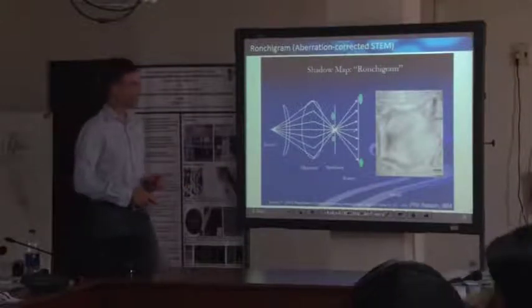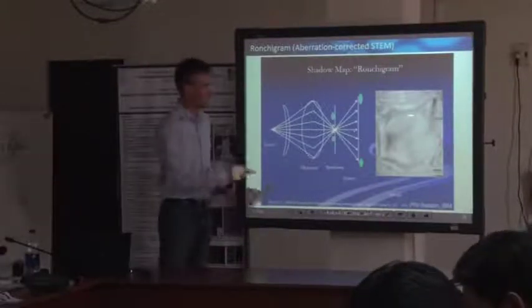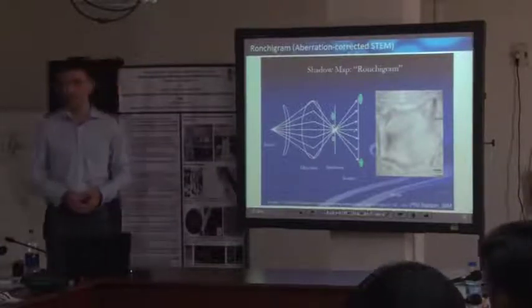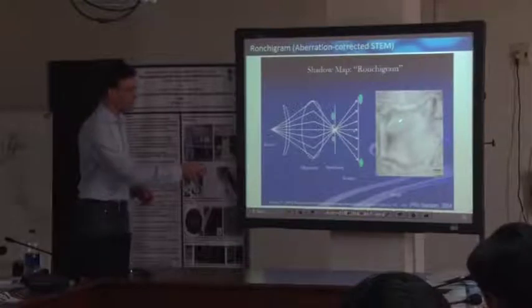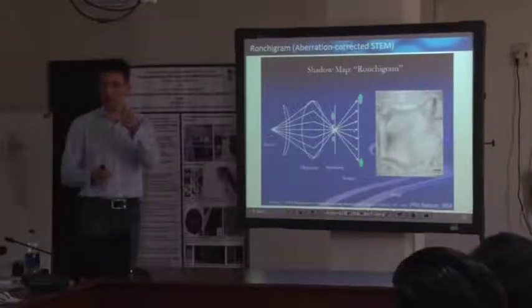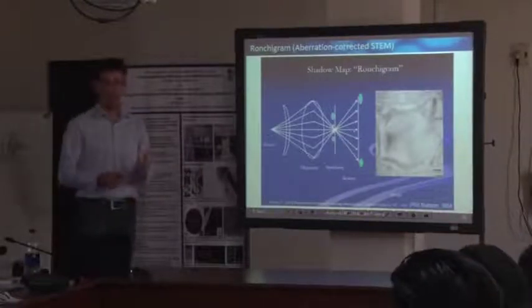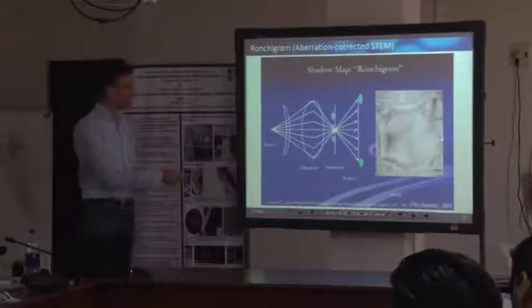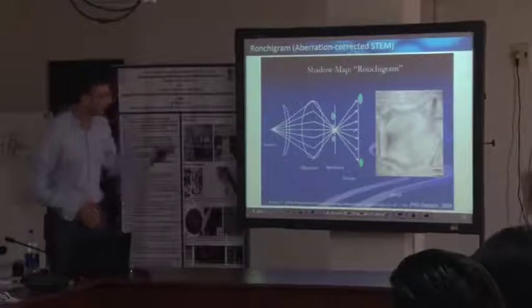So it's a far larger probe, and you see that there is no contrast at all upon focusing the probe on the sample. Because in this region here, where you have this extremely fine electron probe, you end up with an infinite magnification of this very small sample area in this shadow image. So this is a probe corrected probe.